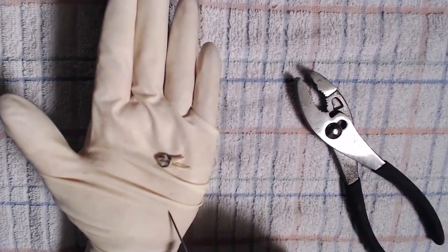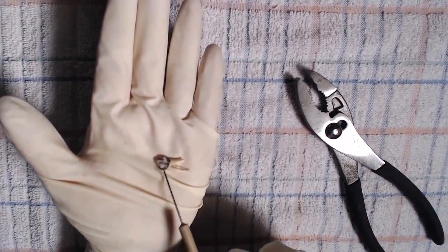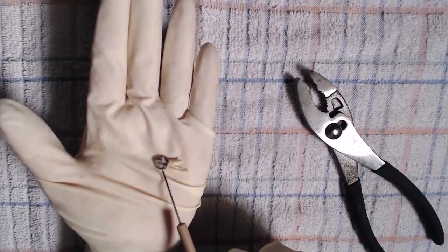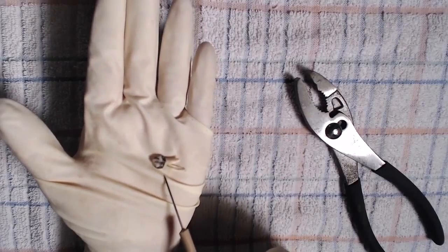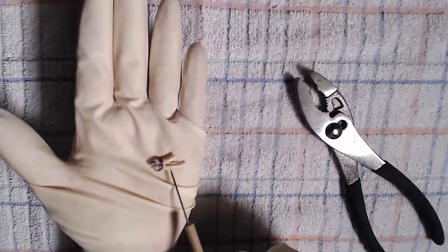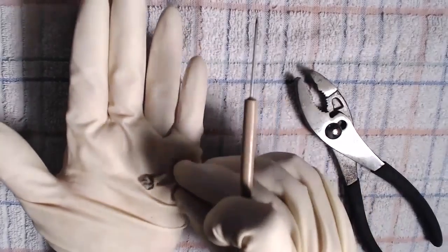Okay, so you can tell the difference between those two structures. The crown is covered with enamel, and then the root is covered with cementum. Okay.